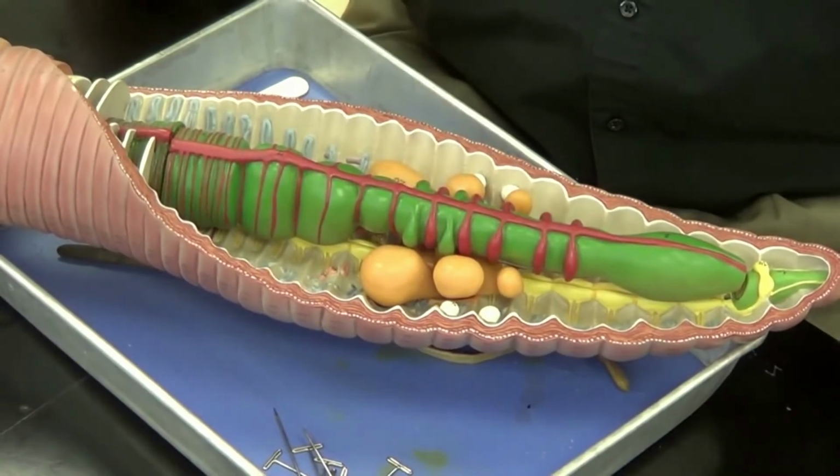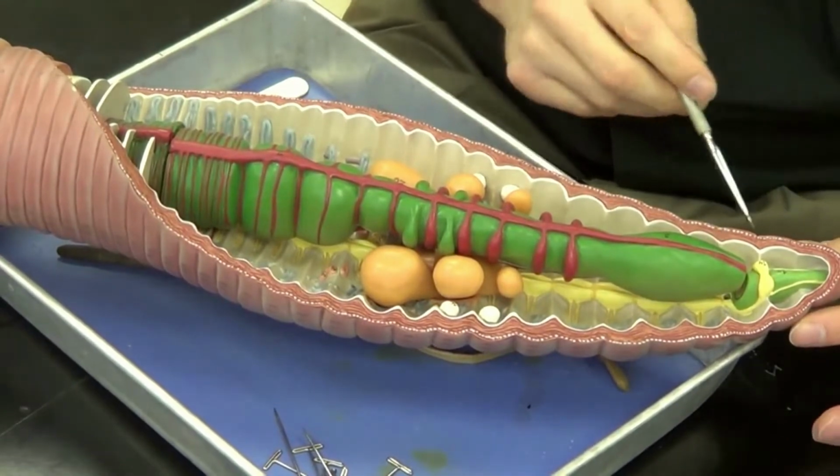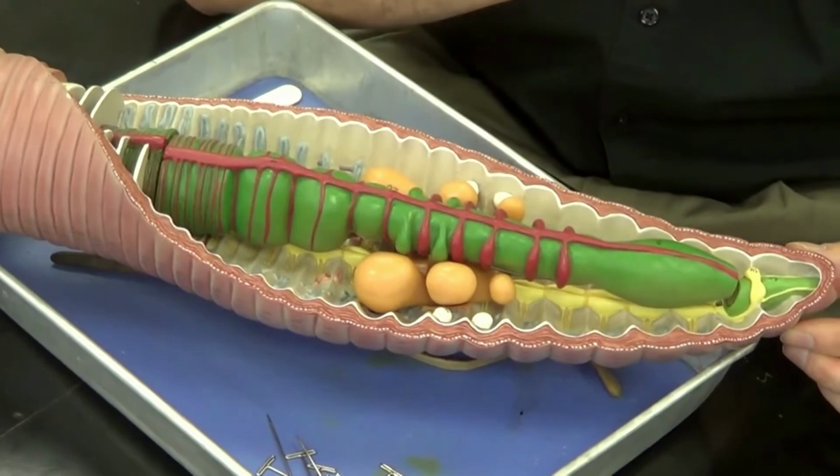Today we're doing an earthworm dissection, and before we actually get down to dissecting the earthworm, I want to take a minute and go over some anatomy. We're going to start with the digestive tract, which is in green here. In the beginning of the digestive tract is the mouth, which is at the most anterior end of the earthworm.